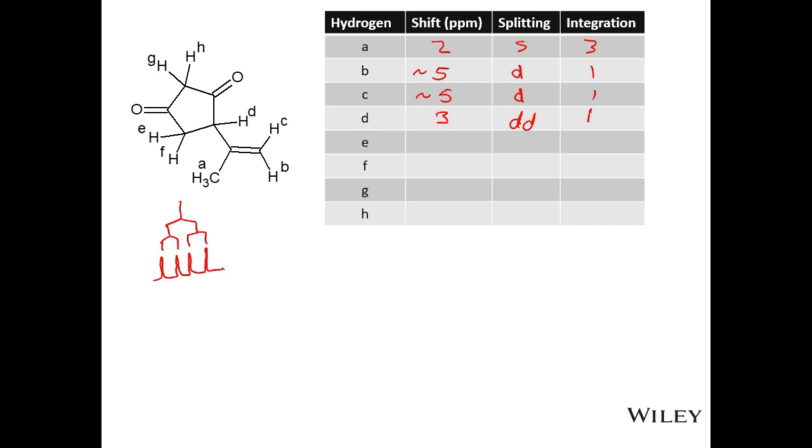And those can be, the center ones can be close to each other. They may be closer to the outer ones, but that spacing will be there. It's a doublet of doublets. 4 peaks, equal intensity, which distinguishes it from a quartet, which would be a 1-3-3-1 pattern. Okay.